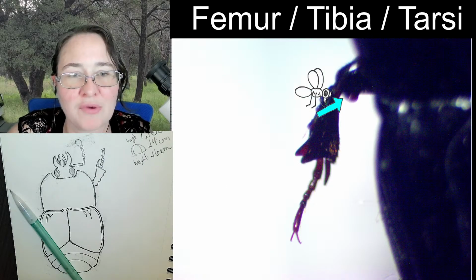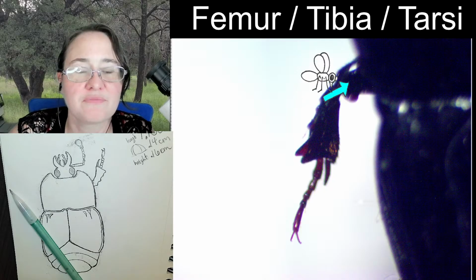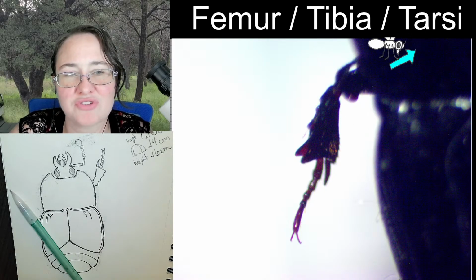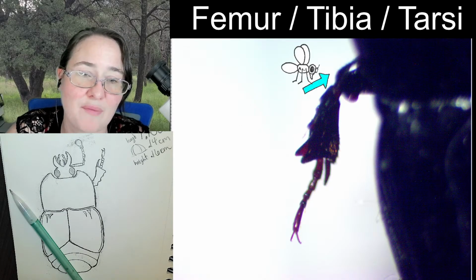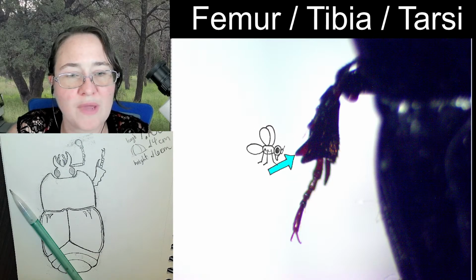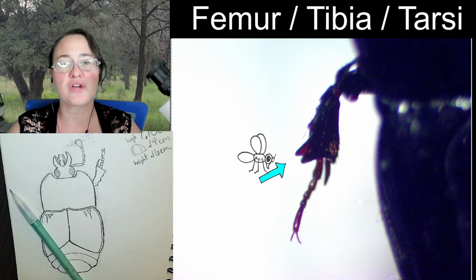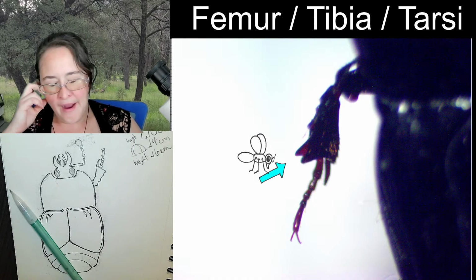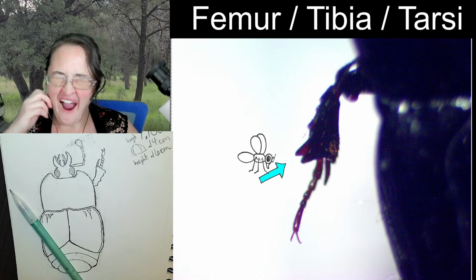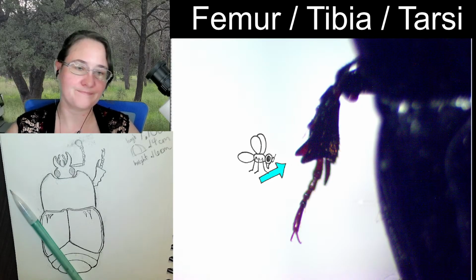This is the femur. It's almost this little stubby part here. Keep in mind that it does go significantly longer. You just can't see it from the top. The tibia here, you'll notice it almost has two little spines, and those are not right next to each other. How do I want to describe it? Those are 3D. I'll show you.